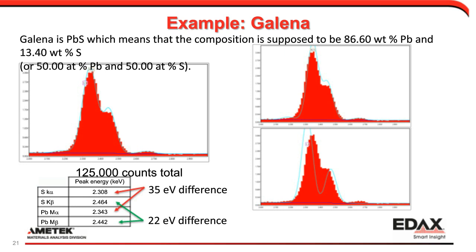So there is lead and sulfur in the sample, but it is heavily overlapped, which means we have to rely on our model to deconvolute this. Even the best EDS detector resolution will not help you deconvolute this overlap. For something like that, you'd need to go to WDS.